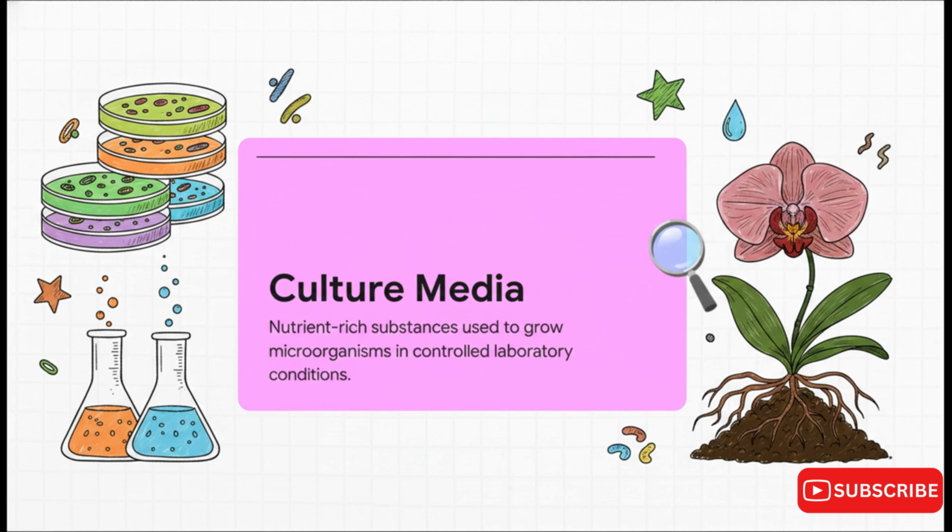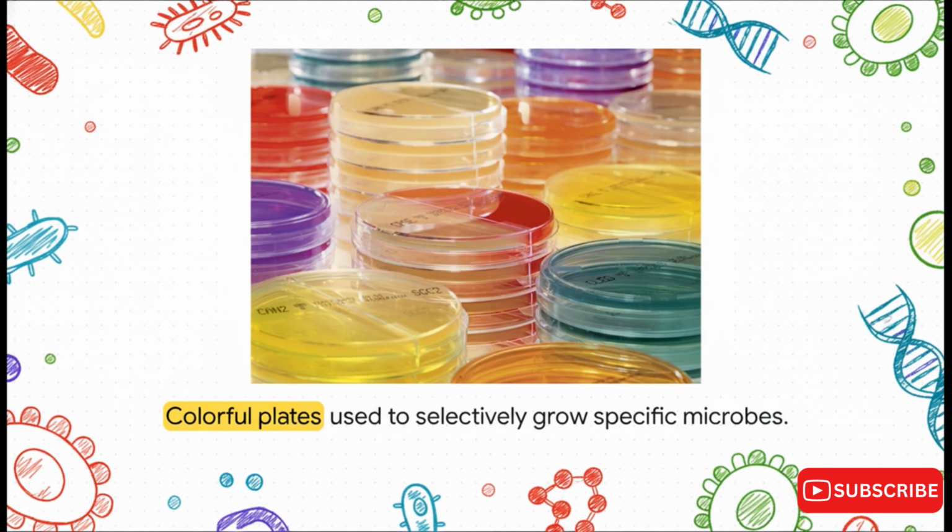Because just as a rare orchid needs a very specific type of soil, different bacteria absolutely require specific nutrients, energy sources, and growth factors to multiply and actually make themselves known to us. Just look at this incredible, vibrant collection. We've got this colorful variety of reds, yellows, purples, and greens, and every single color and composition here is a completely different world, specifically designed to invite a certain type of life to grow. It really perfectly sets the stage for the detailed breakdown we're about to dive into.